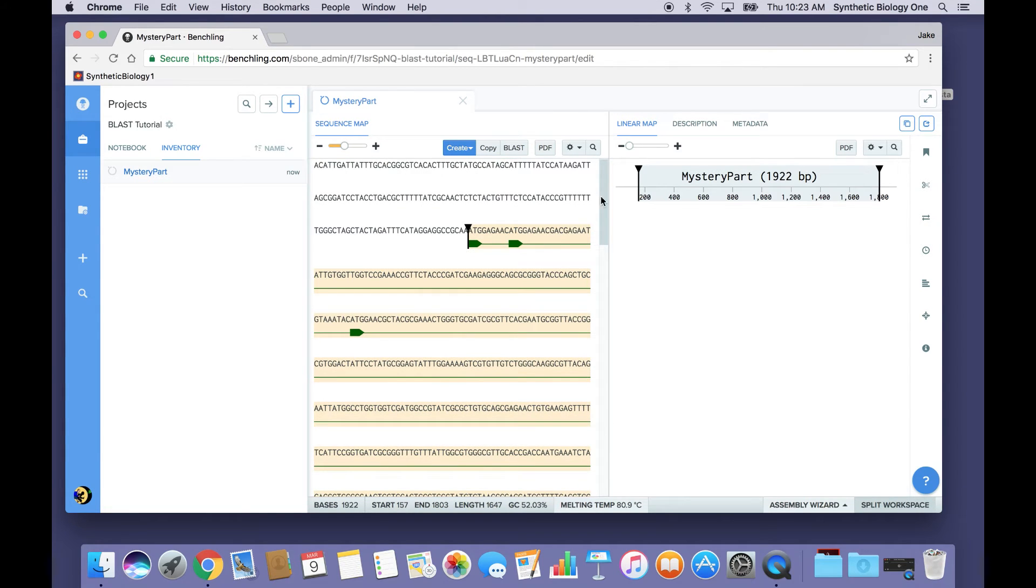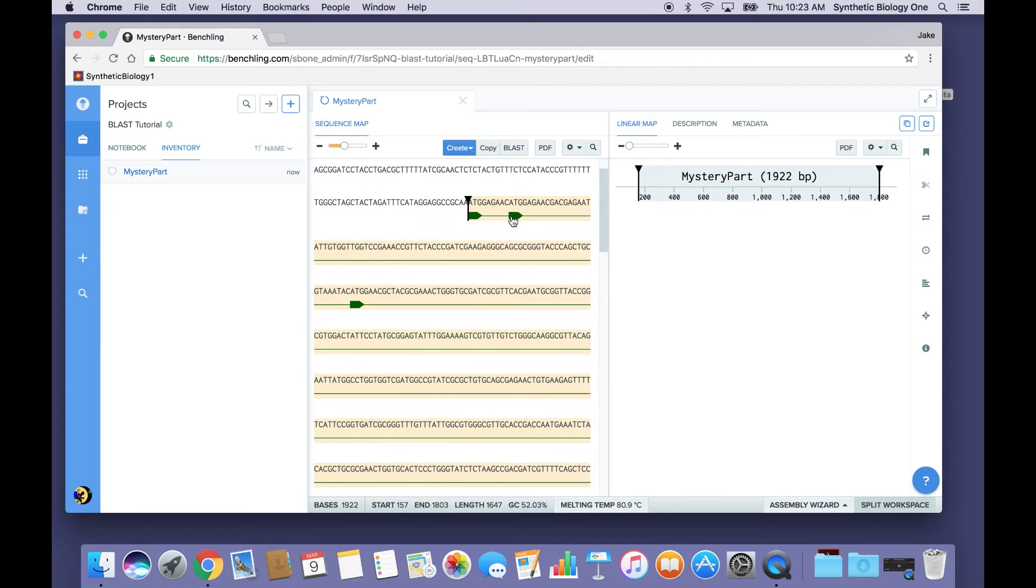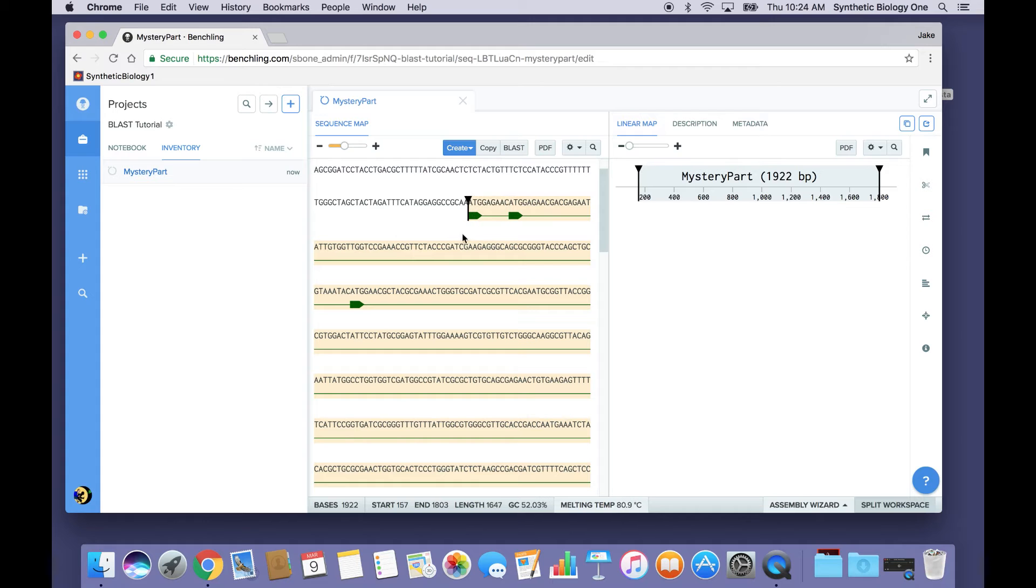So in particular, what this one looks like is that I've got one large ORF and then a bunch of smaller ORFs that are all inside of it. So, for example, this ATG start codon is in frame with this larger ORF.